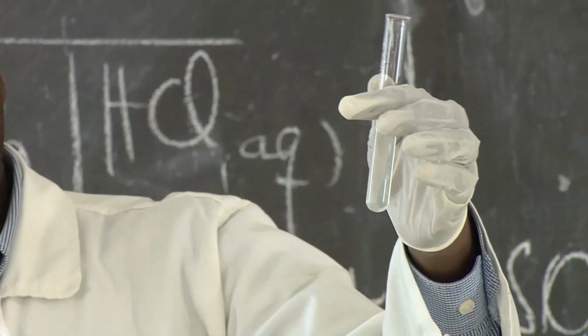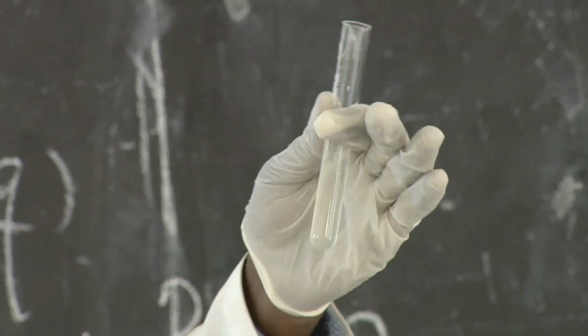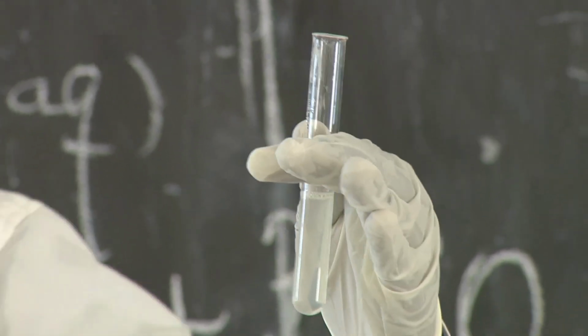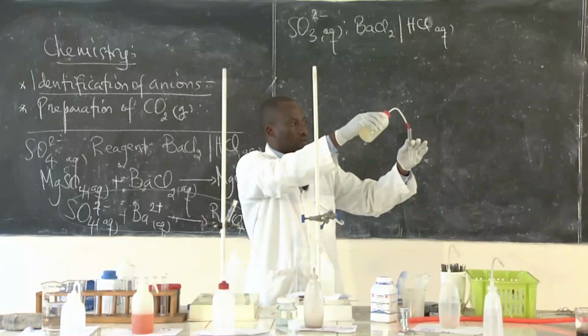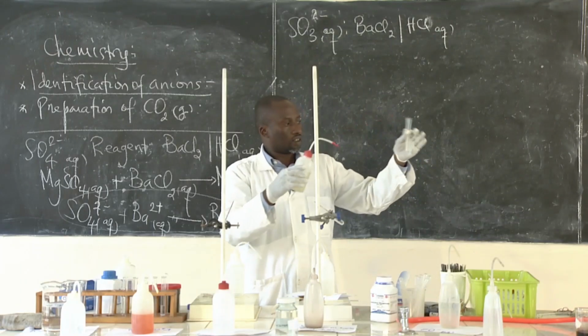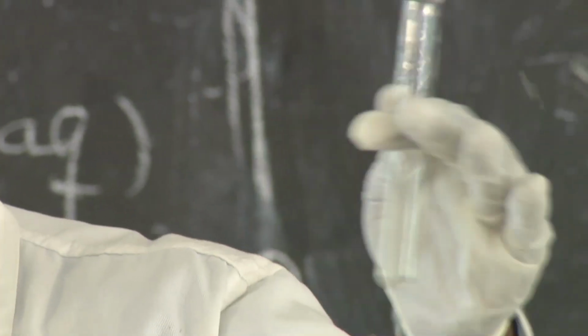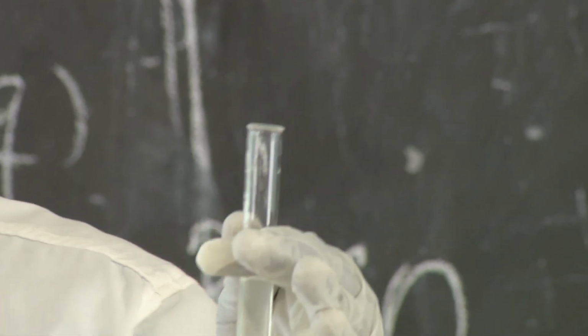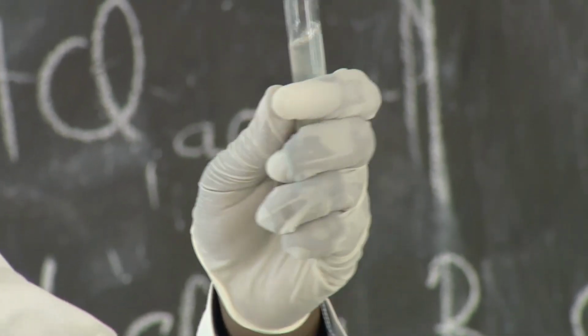When you take a close look at this solution, it is changing. The precipitate is disappearing in this solution. It is slowly disappearing and turning into a colorless solution.